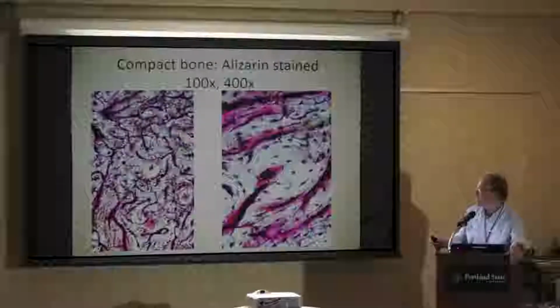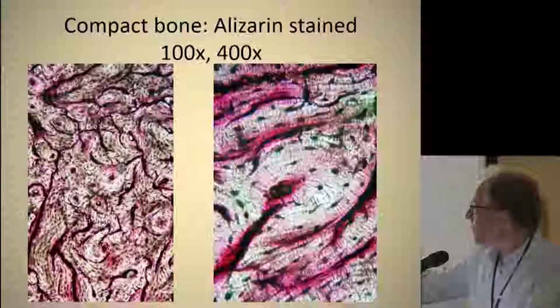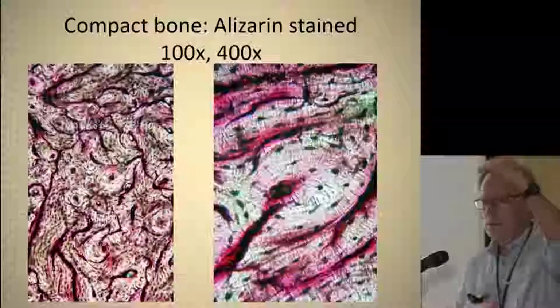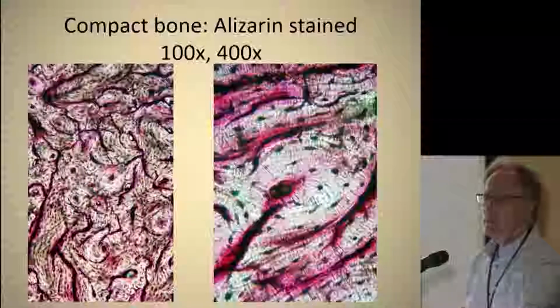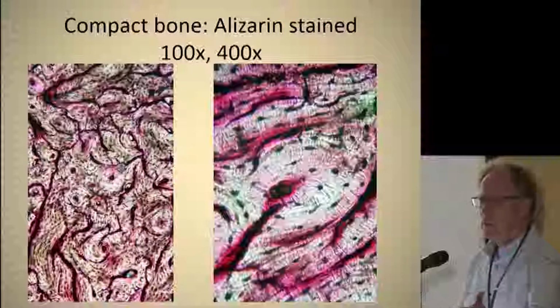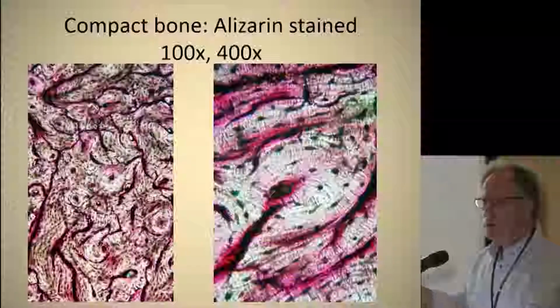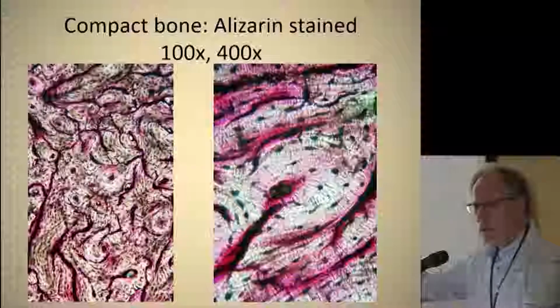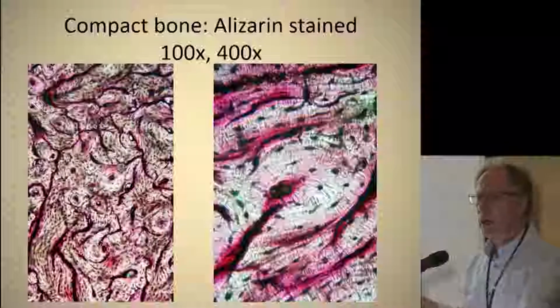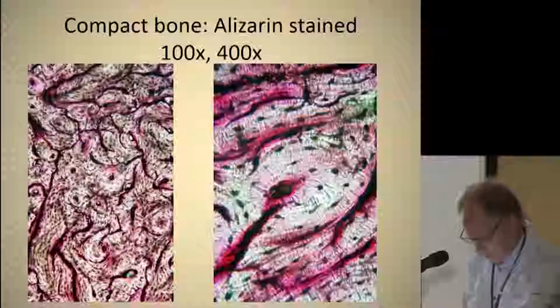If you take the same tissue and then stain it with alizarin red, now you can see where the calcium is being deposited in those lamellae, and that's literally what gives compact bone its axial strength. If I did this same thing with osteoporotic bone, or maybe even in embryos that were cultured under a low calcium condition, hit it with alizarin red, you'd see these great big deficits where there should be calcium. So very cheap, very easy to do. Within about a 3-hour lab, students can get these kinds of results, and then it's up to them to build up their own image bank.